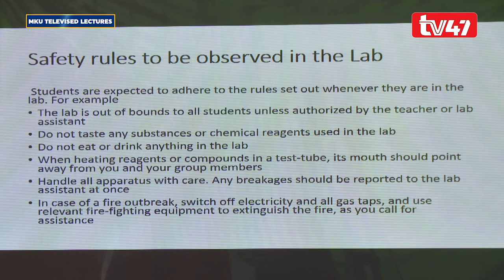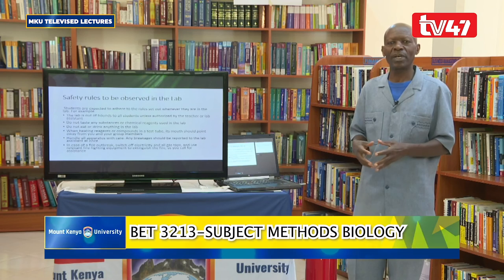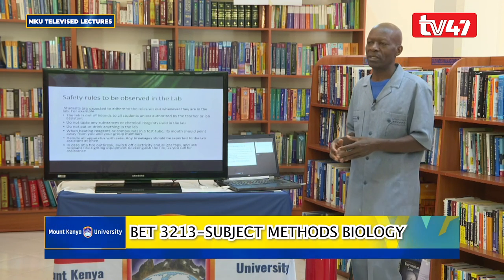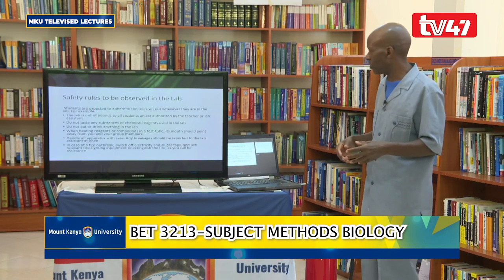The next one is you should not drink or eat anything in the biology lab. And then, when you are heating substances in a test tube, the mouth of the test tube should face away from you and from the group members who are present when you are carrying out the activity. Then, handling of apparatus: all the apparatus used in the biology lab should be handled with care. In case of breakages, this should be reported to the lab assistant so that action can be taken before they pose a danger to the users.